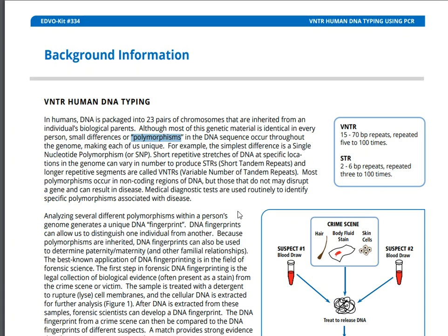So your DNA is made up in a certain way with a certain order of base pairs. My DNA is made up in a certain way with a certain order of base pairs. And what we're going to discover is that the order of those base pairs is pretty important, because those create these changes in the DNA strand, and those changes can be compared in DNA PCR electrophoresis, as well as many other things. So there are a couple of different terms for these polymorphisms.